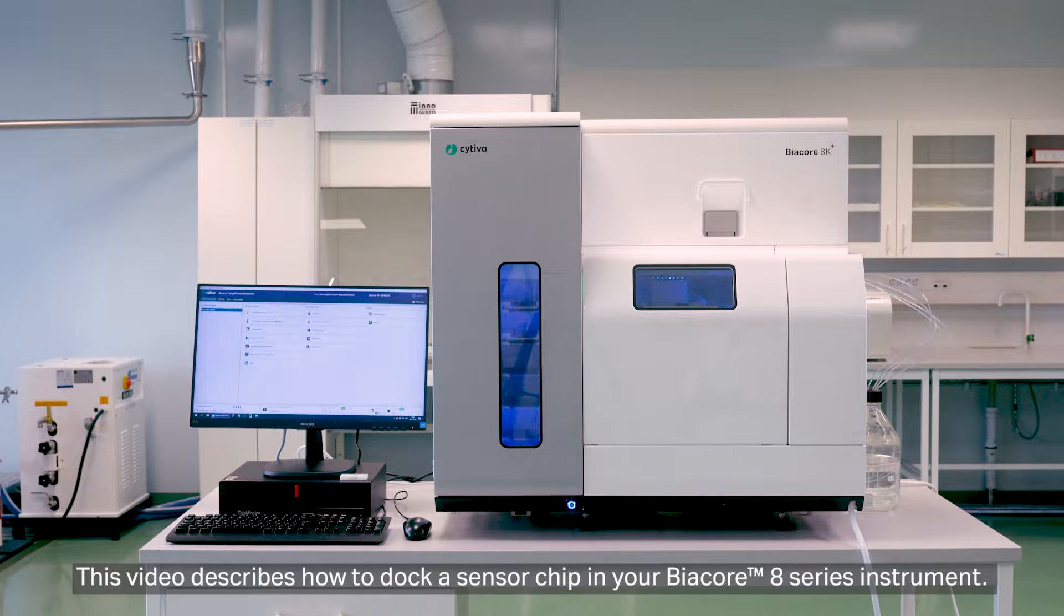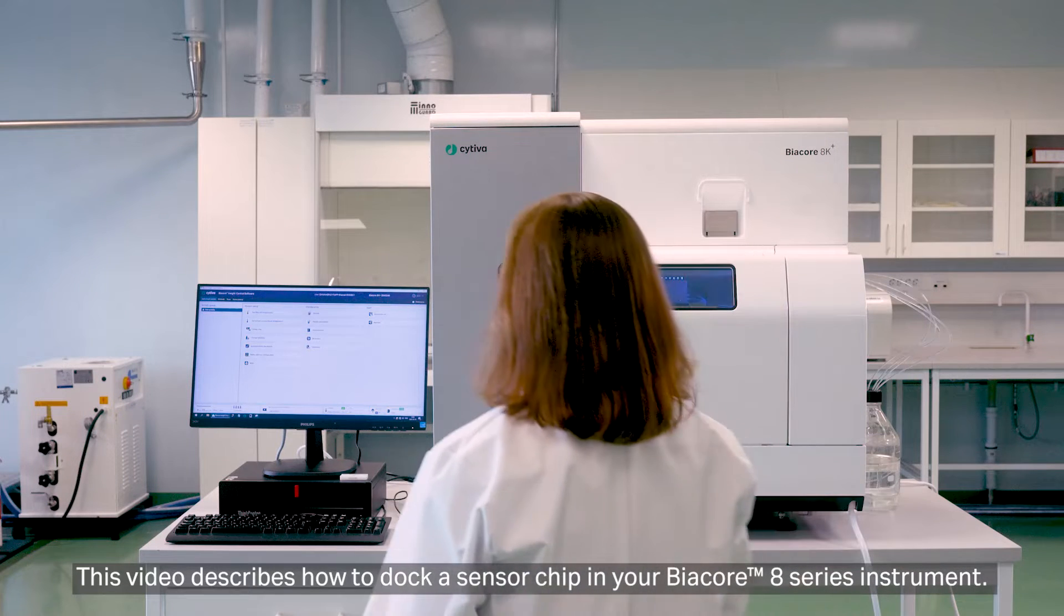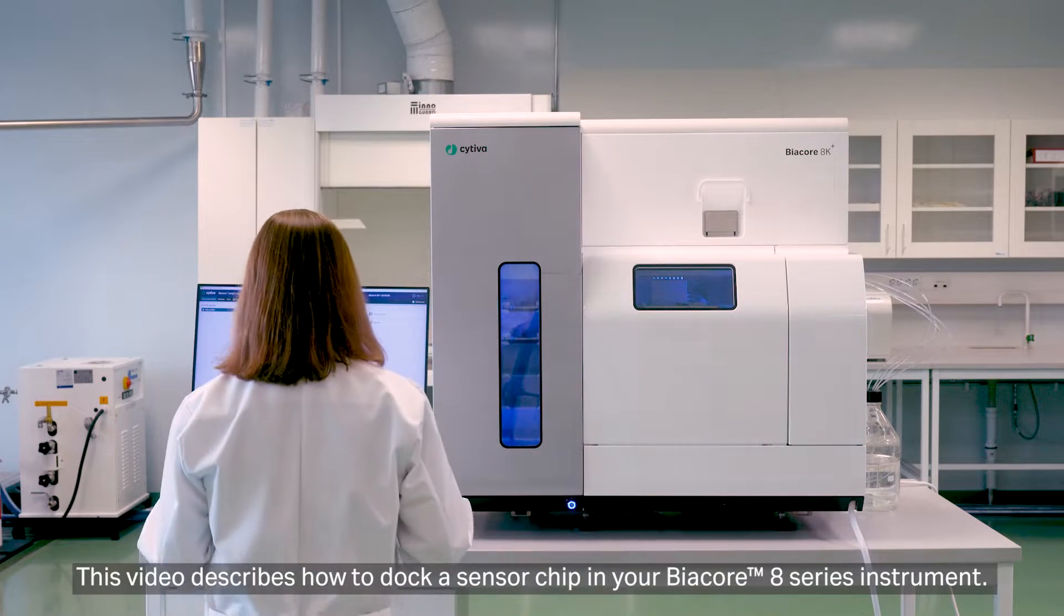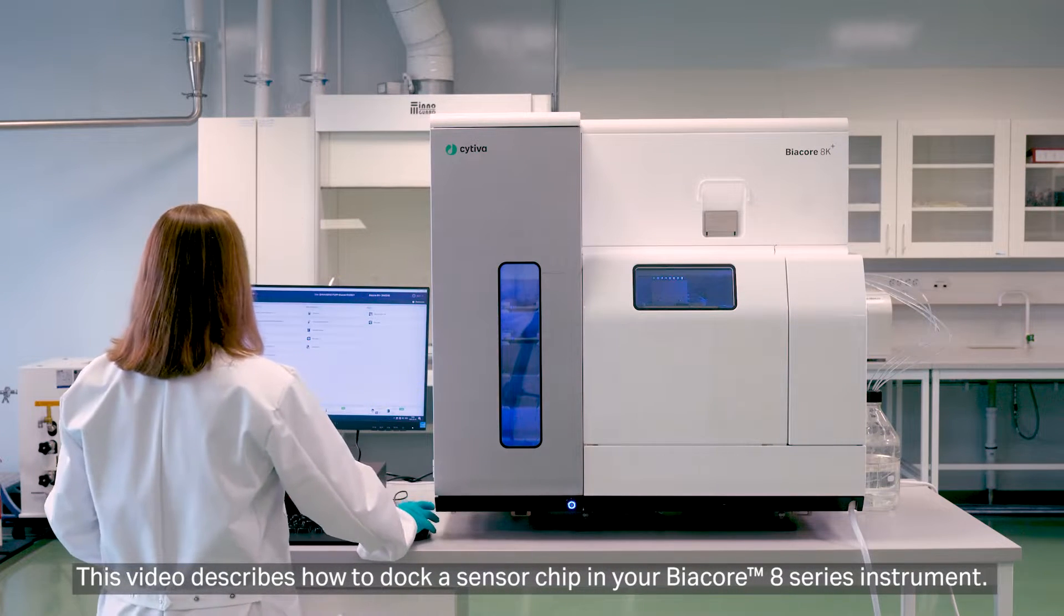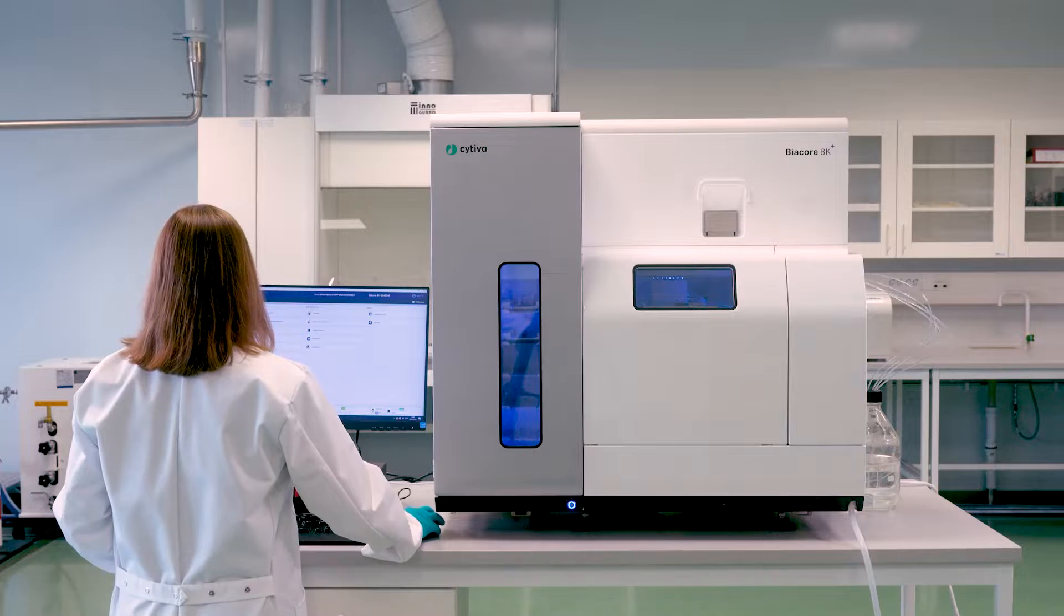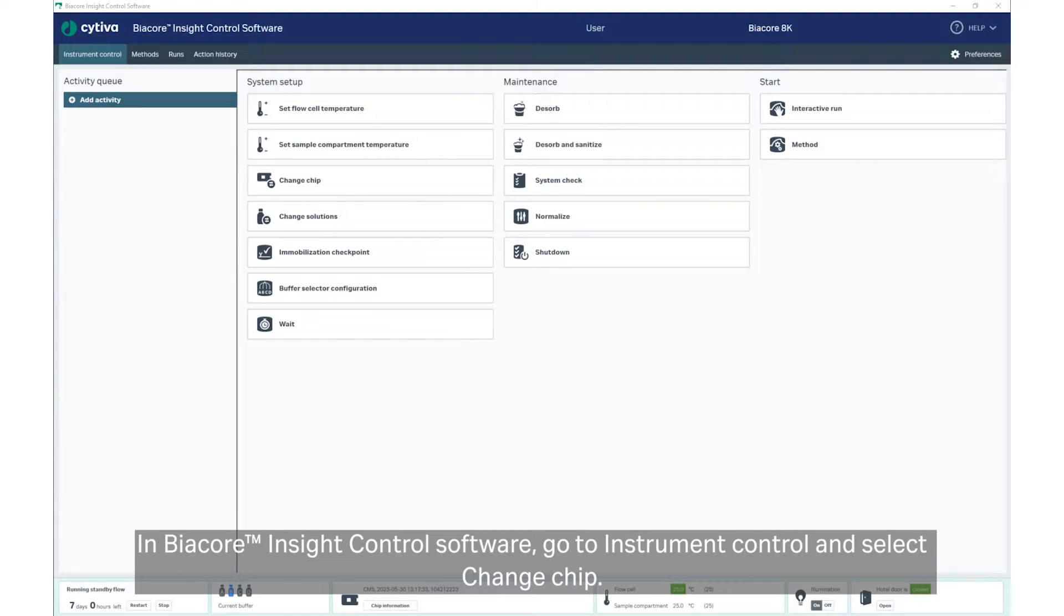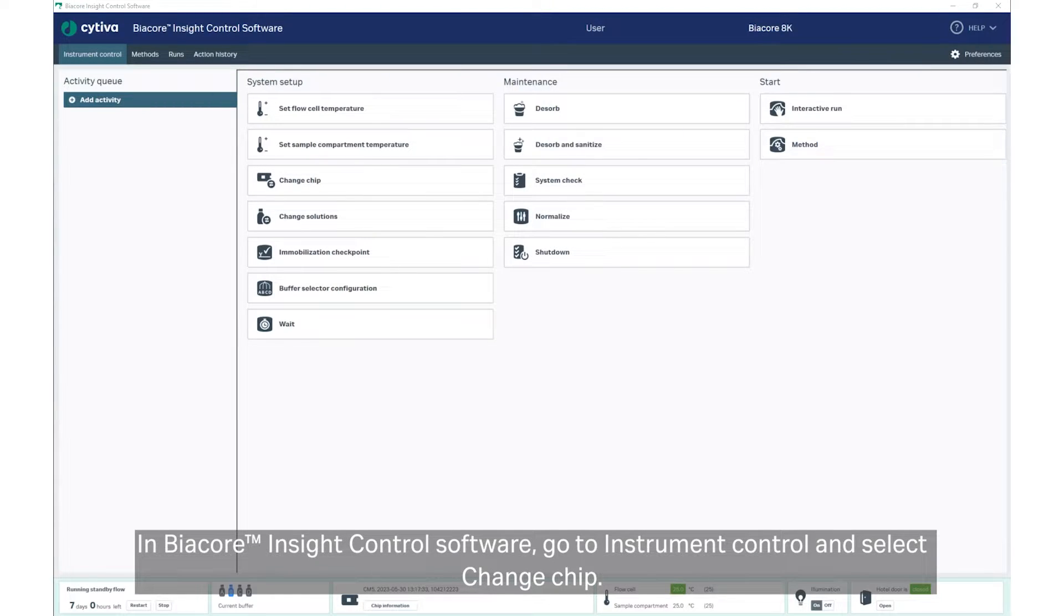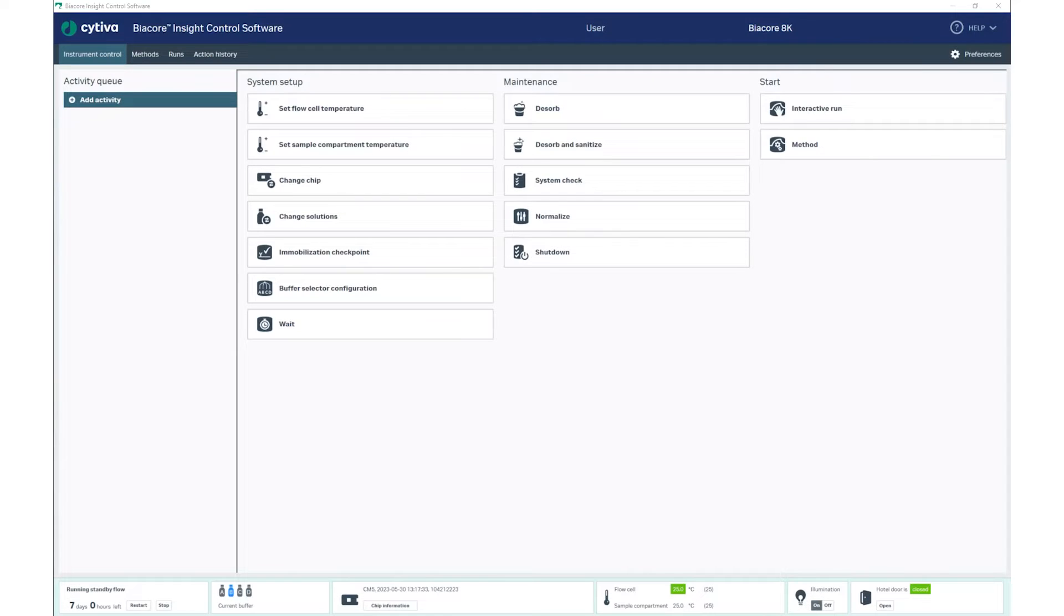This video describes how to dock a sensor chip in your Biacore 8 Series instrument. In Biacore Inside Control Software, go to Instrument Control and select Change Chip.